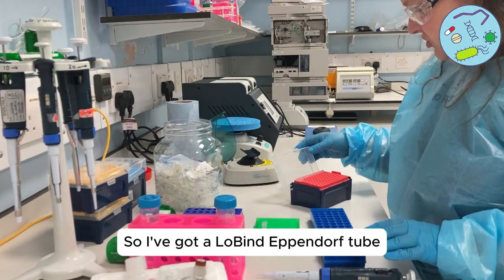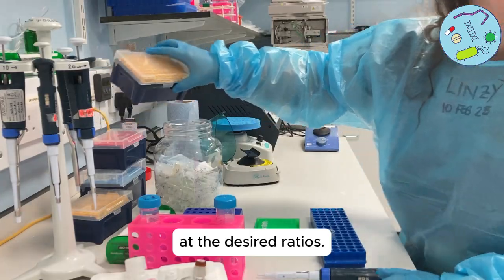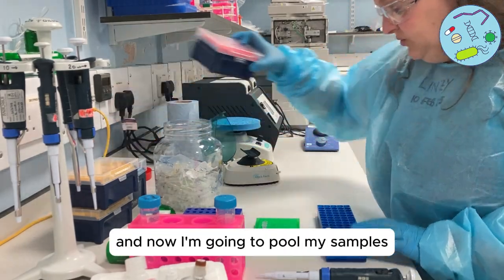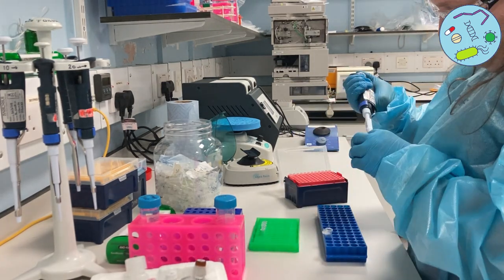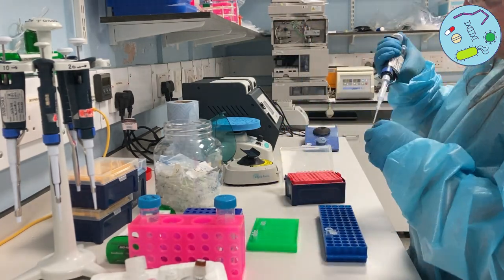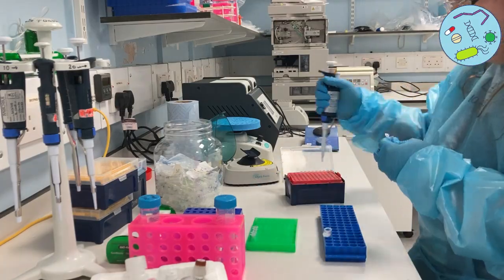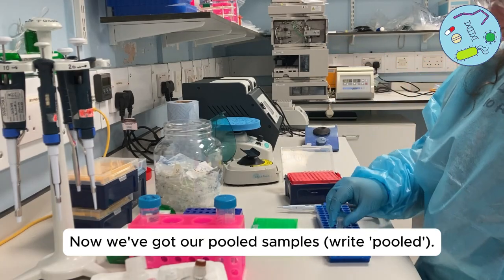I've got a low-bind Eppendorf tube and I'm now going to pool all of the samples at the desired ratios as per the spreadsheet. So now we've got our pooled samples.